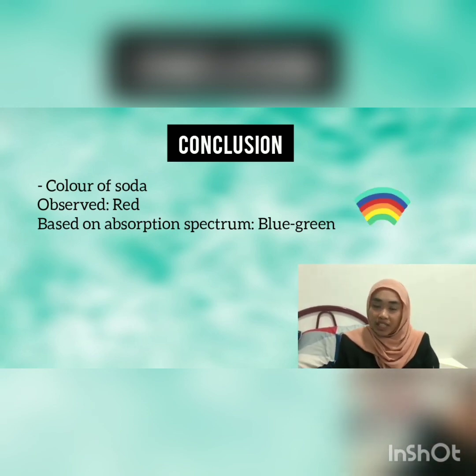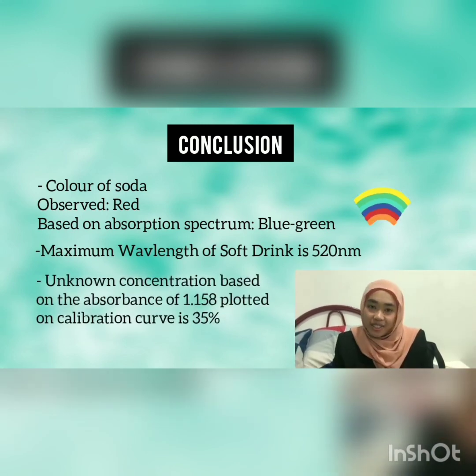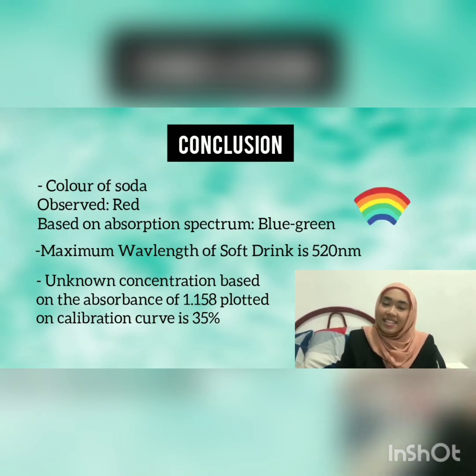In conclusion, the color of the soda observed is red, but the color based on the absorption spectrum is blue-green. The wavelength is 520 nanometers. The unknown concentration based on the absorbance of 1.158 is 35%.